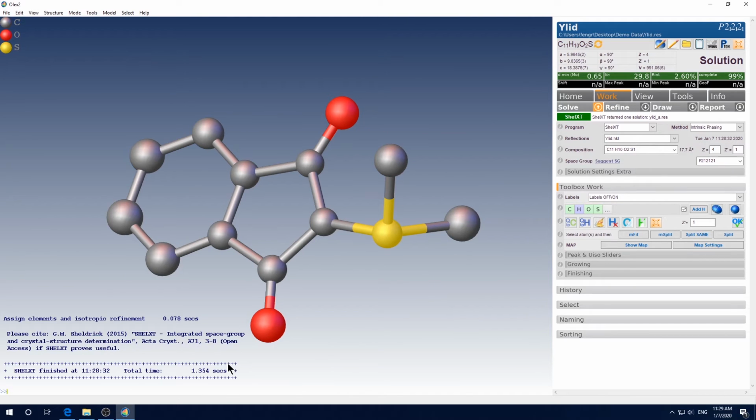Now it is a good time to introduce the interface of this program. The top menu is a file menu bar. This is less often used other than to open, close, and save the files. There are other functions, but we can always access them from elsewhere.